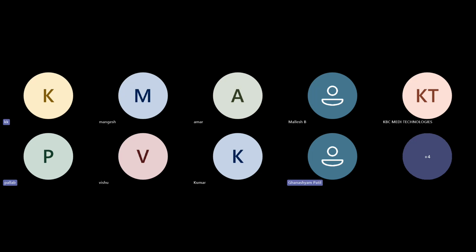You can't get either LabWare LIMS or Star LIMS, any of the applications. Also, in our session, do you teach master data creation and query running? Yes, of course.